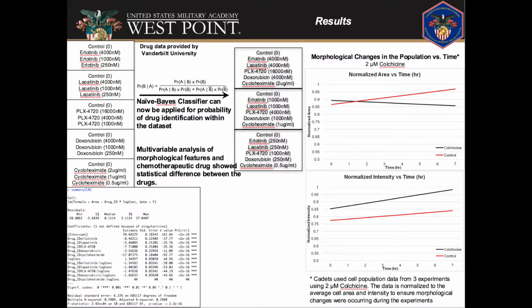Our results have demonstrated that morphological changes can be graphed, and we can identify differences in cell morphology when a drug is added. And statistical differences are obvious, and with further research we can probably detect the drugs.